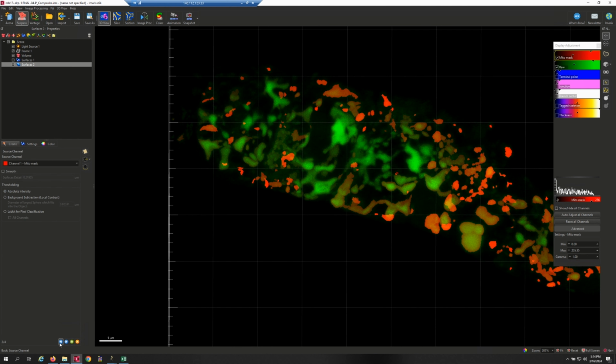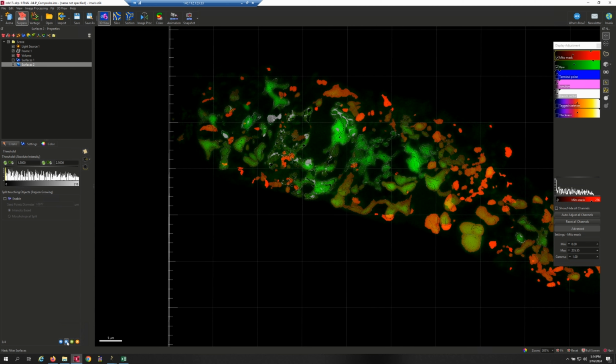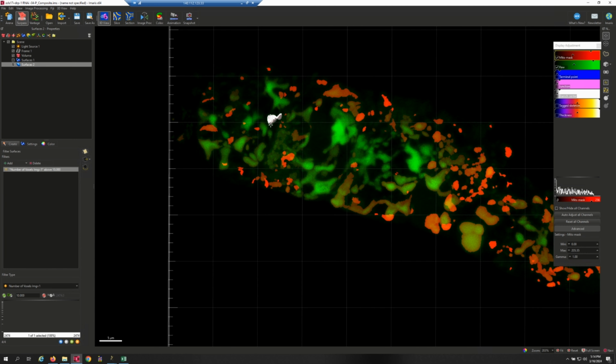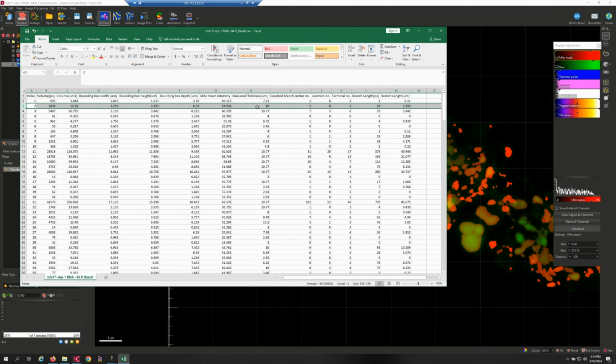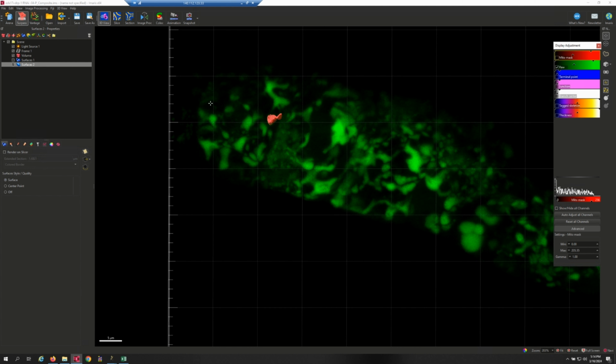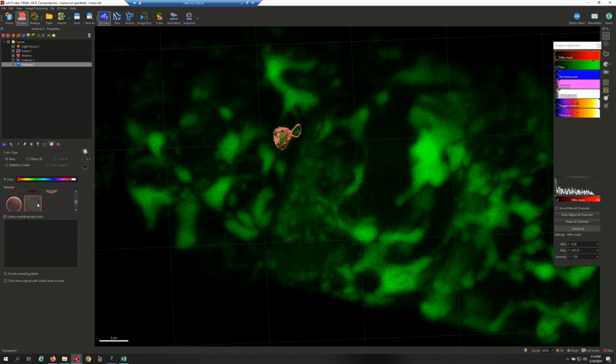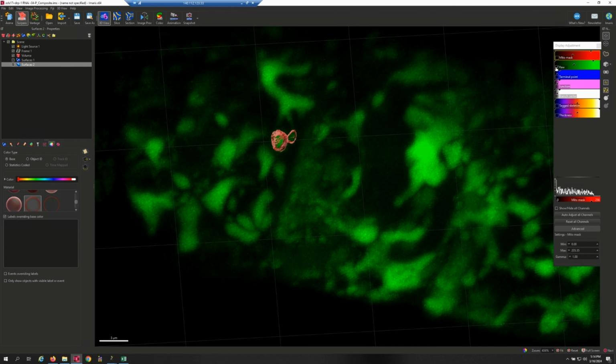Make sure I'm on the correct channel now. The first channel. 1.5, 2.5, okay, then it will highlight it for you. Where we are now. With the image of number 2 in the table, and this pair of numbers on both sides, indicates where it is in this image. This is almost over. Alright, after it's done, I'll turn off the mask. Then we can adjust the surface. Here in the color palette, set it to be semi-transparent. Under the semi-transparent condition, maybe even fully transparent. We can turn off the raw data first.